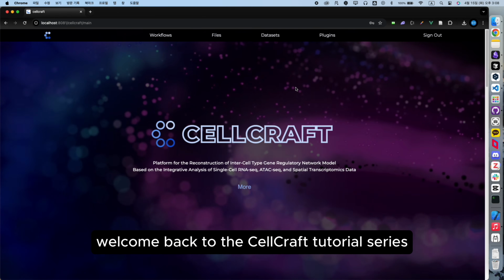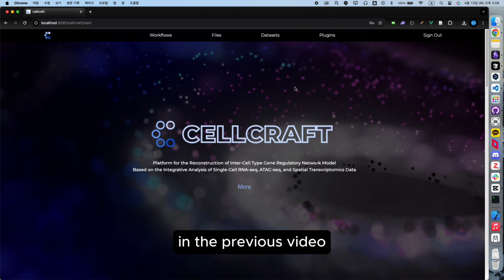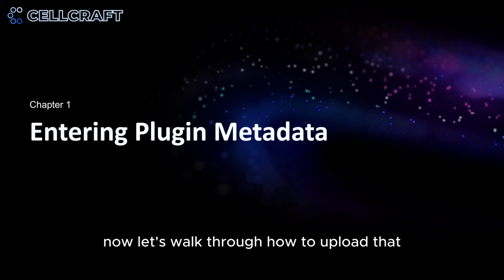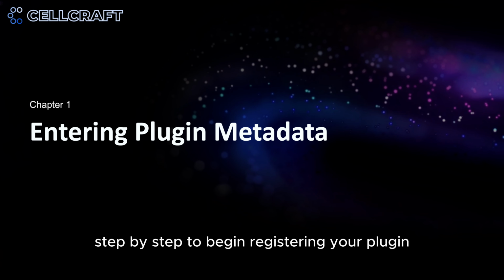Welcome back to the CellCraft tutorial series. In the previous video, we created a plugin using custom scripts. Now let's walk through how to upload that plugin to the CellCraft step by step.